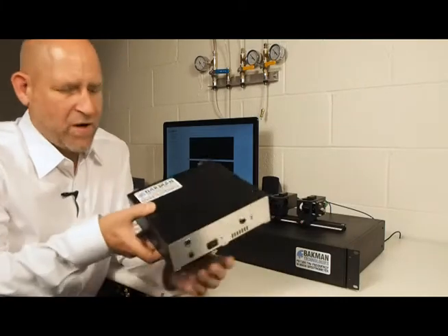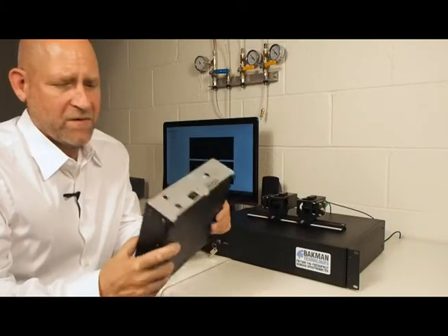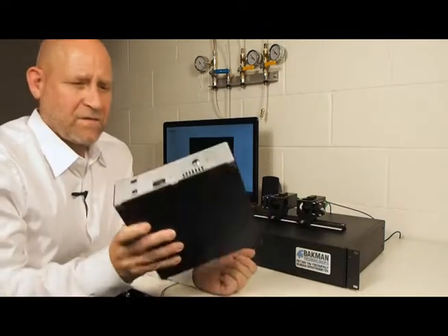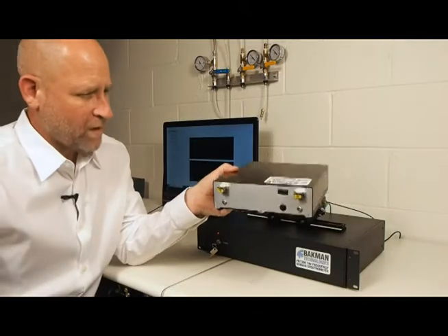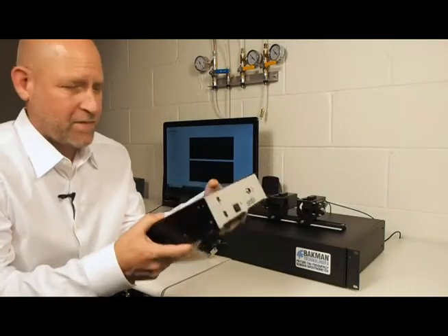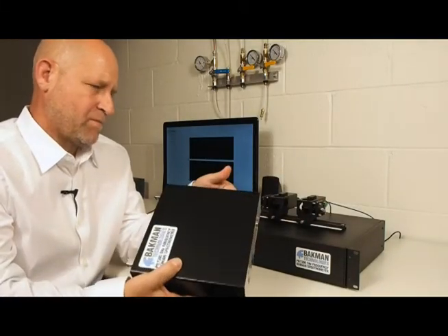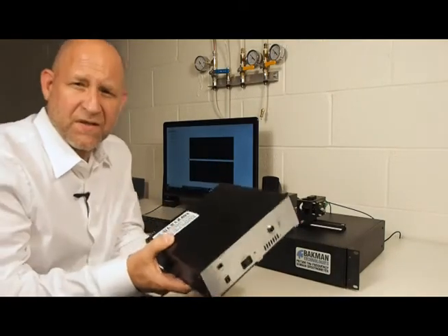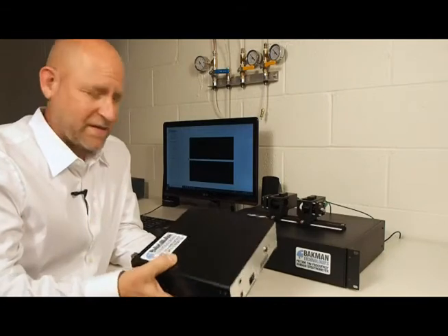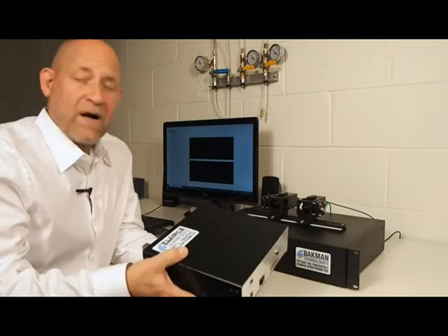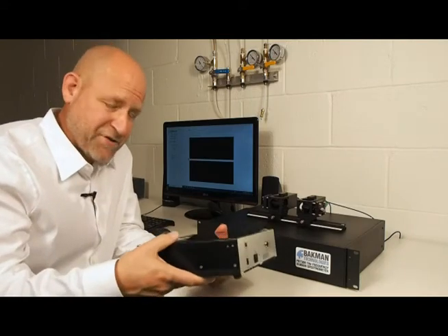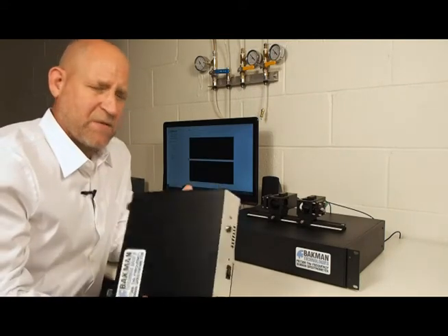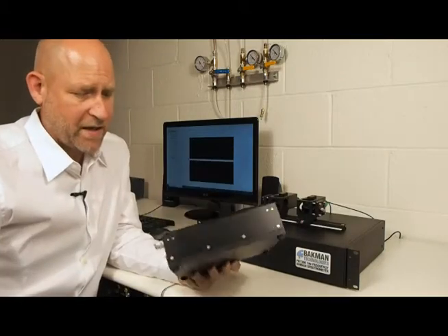This is the brand new release PB7300 frequency domain terahertz spectrometer and this is the form that most customers purchase the unit in, which is a very compact lightweight spectrometer. It was designed specifically for avionics applications for detection of gases at remote locations. It is 200 millimeters by 200 millimeters by 50 millimeters high.